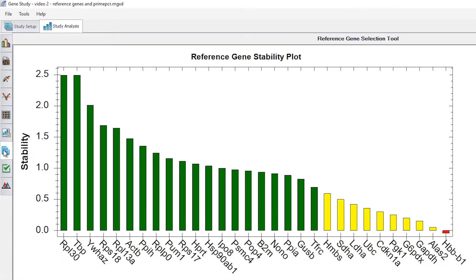What we see now is a plot of the stability of all of our reference genes. In viewing the bar chart plot, we can see that higher values represent more stable genes. Genes have also been color coded into three categories. Green is reserved for genes with the highest stability, which will provide the most accurate normalization factors. Yellow genes have acceptable stability.